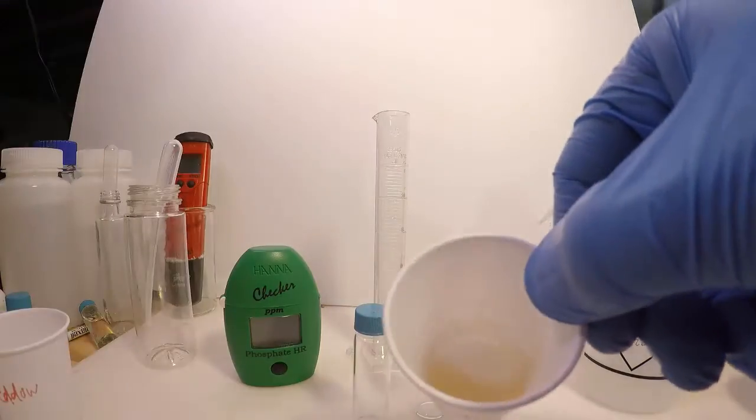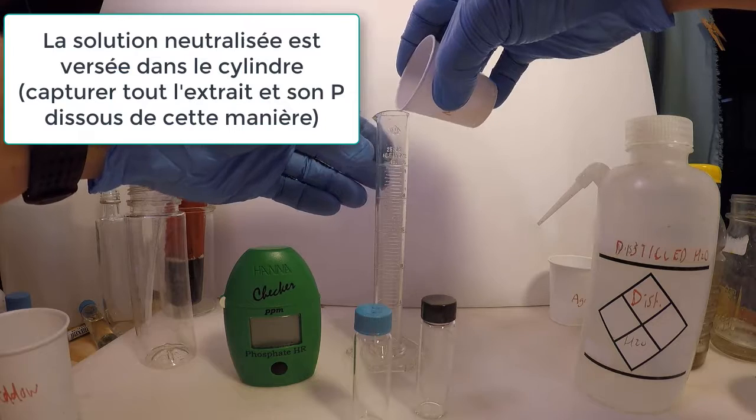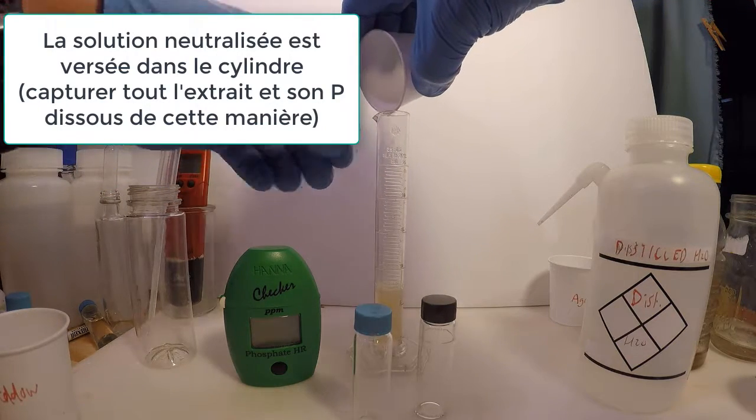Next, the neutral solution is made up to a standard volume of 20 milliliters that will create the right amount of extract for reacting with the reagent package.